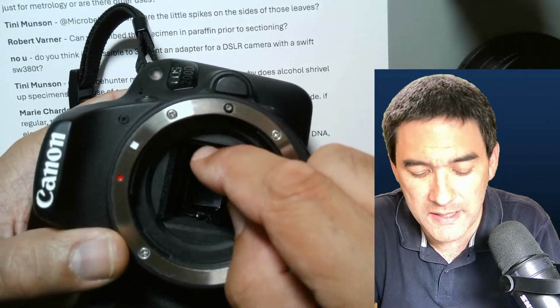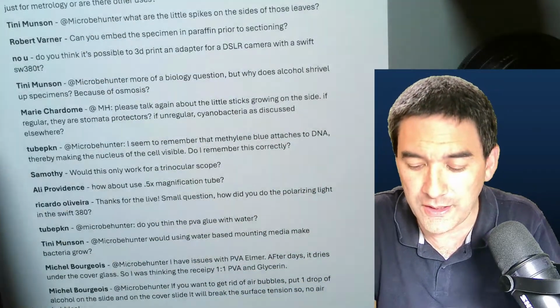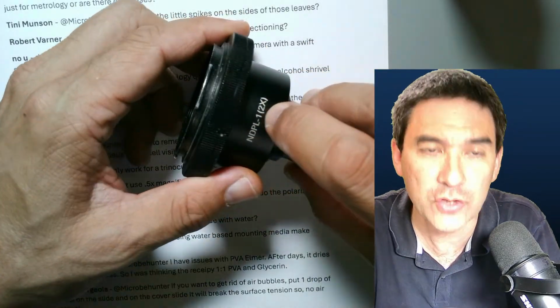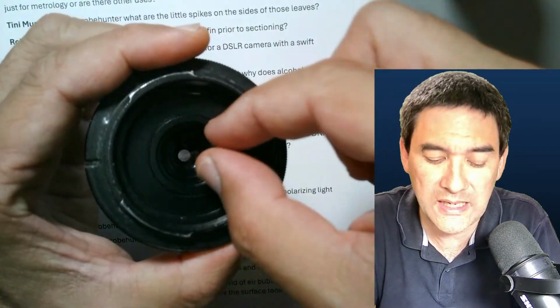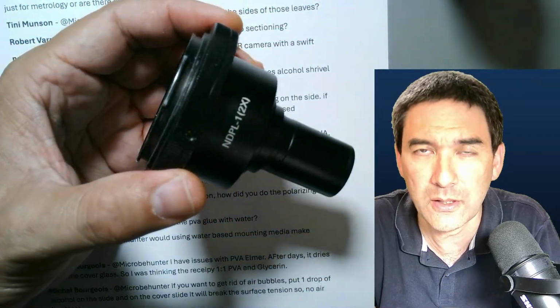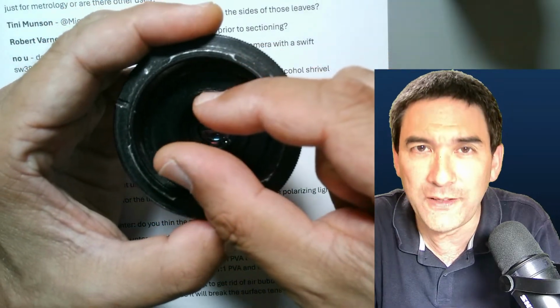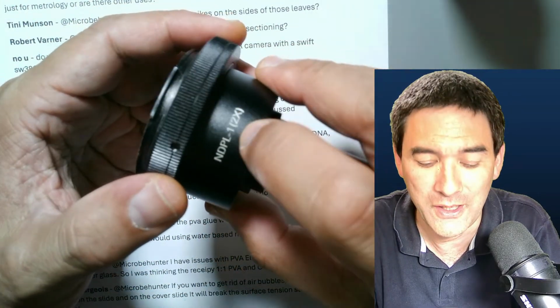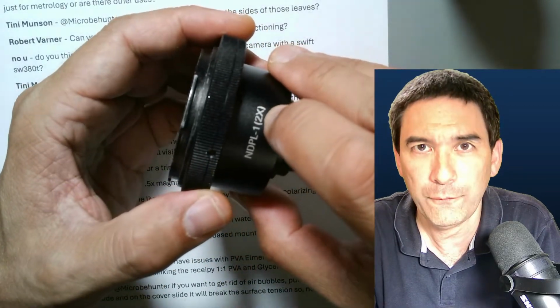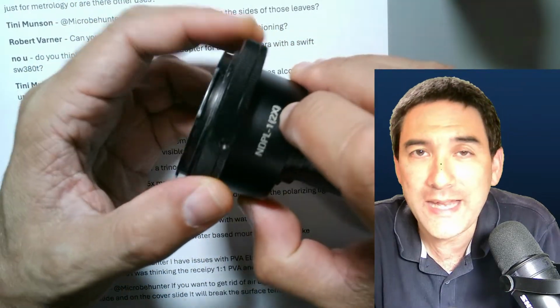So this basically means that the sensor over here is significantly larger than the diameter of the tube. For this reason, you need a magnification which is greater than 1, to essentially take a small image and make it larger. And if you now have a small USB camera with a small sensor, then you have to compress the image down to make it fit on the sensor. That's why you have magnifications of 0.3 or 0.5. So the magnification over here is important for adjusting the size of the image to the sensor size, and each sensor size has somewhat of its ideal magnification.